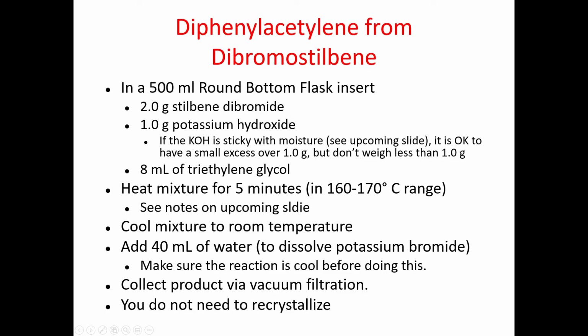Once we've dissolved our potassium bromide, the last thing we do is just collect via vacuum filtration, and that'll be it. We do not need to recrystallize our product.